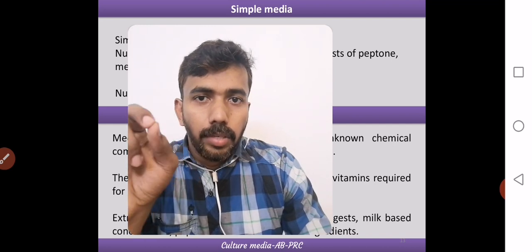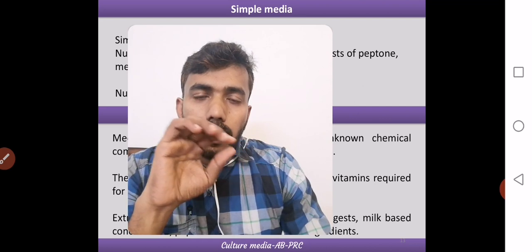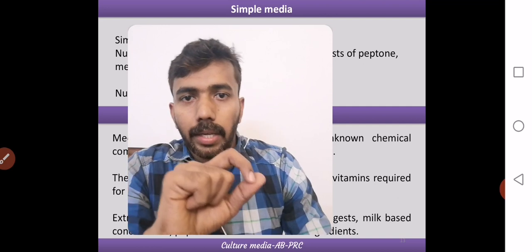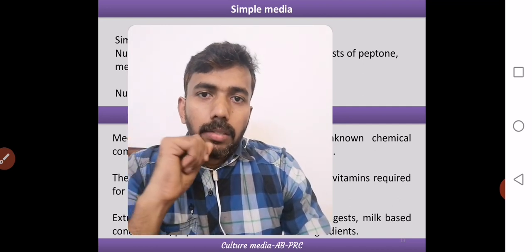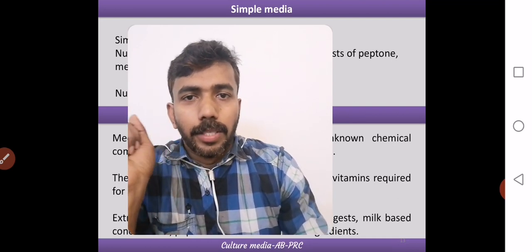That will be the first thing we address, and the second thing is we will see a number of special media including enriched, selective, differential, etc. So their special applications and other things will be discussed. Okay, so let's move to the presentation.